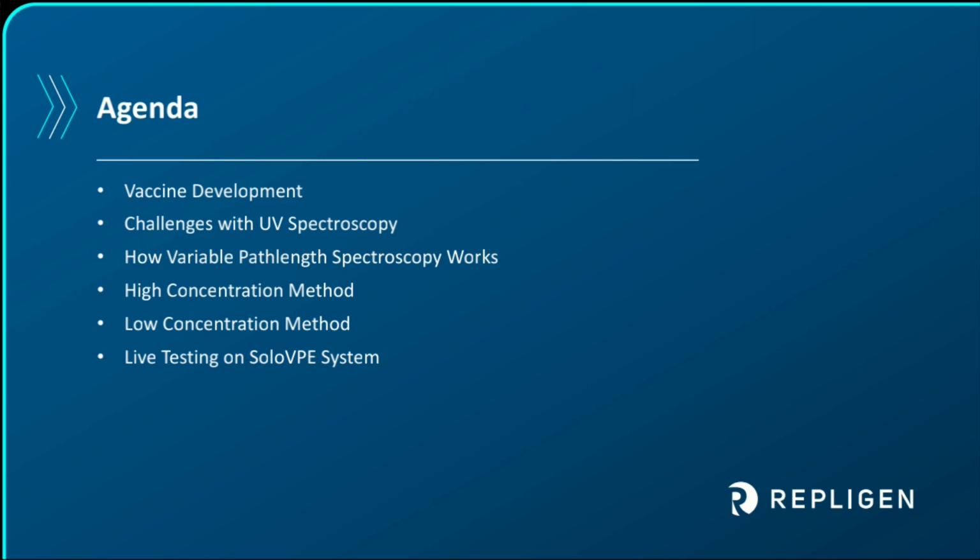We're going to briefly talk about vaccines and how the SoloVPE relates to them, challenges with UV spectroscopy, how slope spectroscopy works. We're going to be going through a high concentration and low concentration method, and then again, we'll be doing a live test on the SoloVPE system.